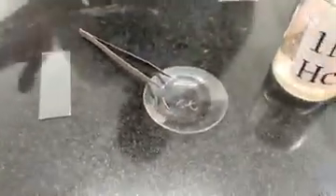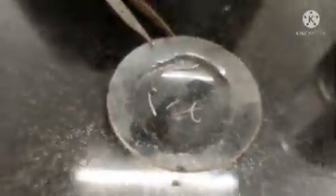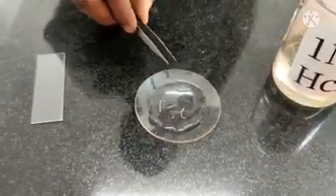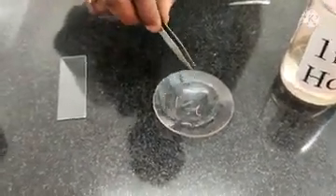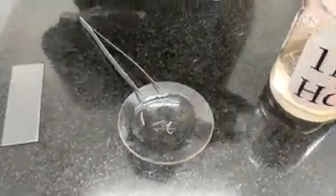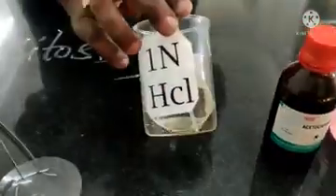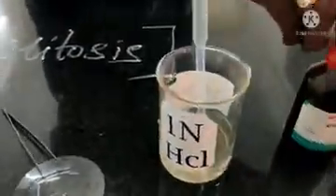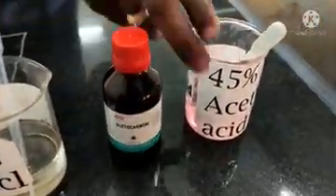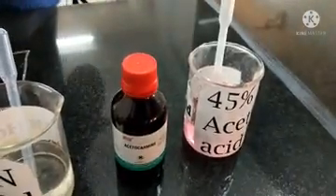In order to prepare this mitosis slide, we require onion root tips. These are the onion root tips. On your table you will also have a watch glass. You have to come with forceps and the watch glass, take out 1 or 2 onion root tips, and go to your place. These are the things required to prepare the slide for mitosis: 1 normal HCl, then acetocarmine, which is a nuclear stain, and 45% glacial acetic acid.